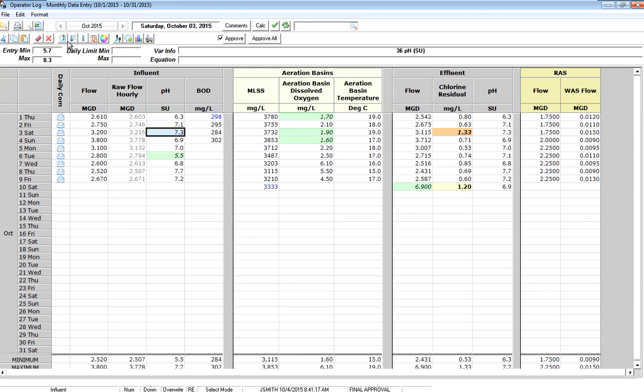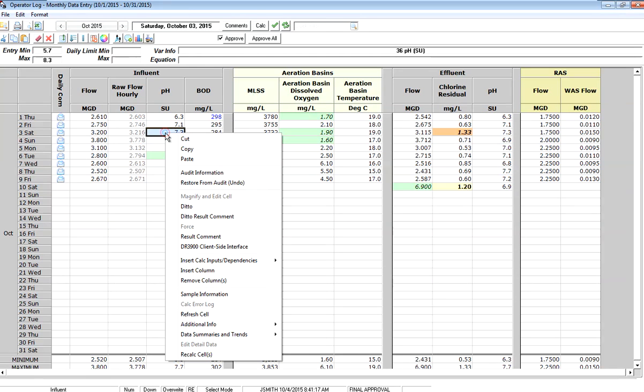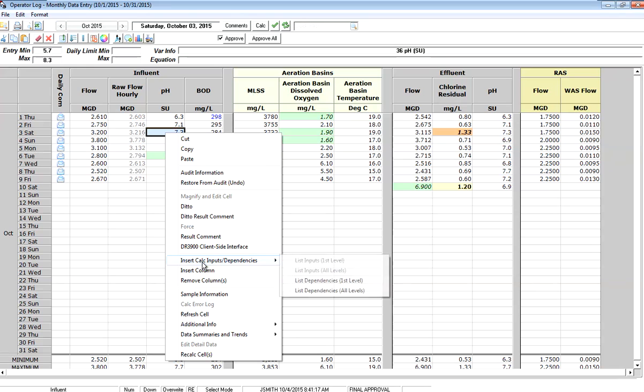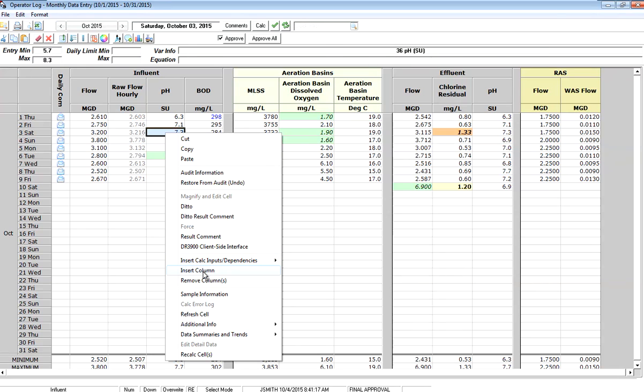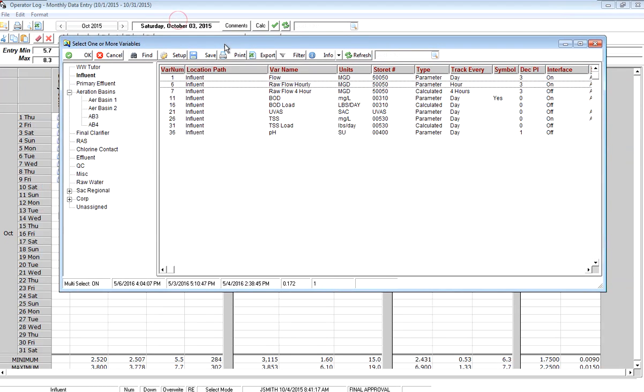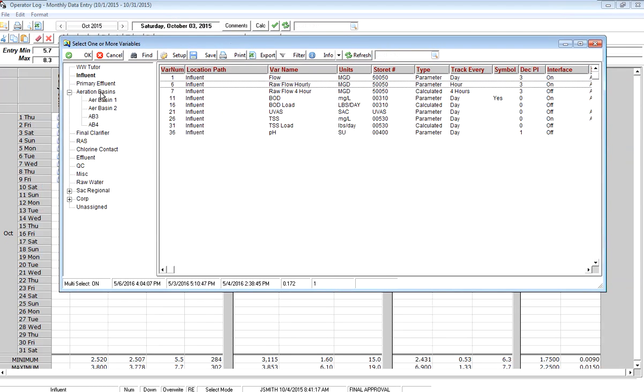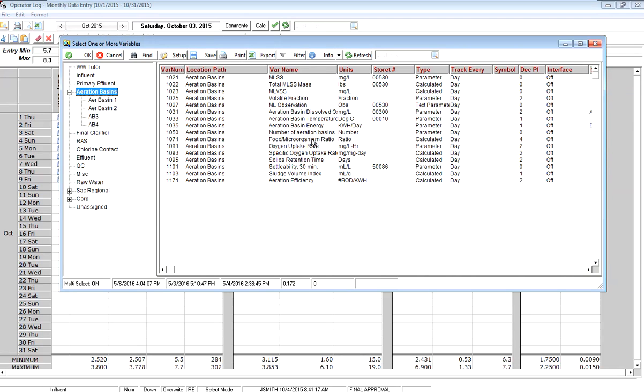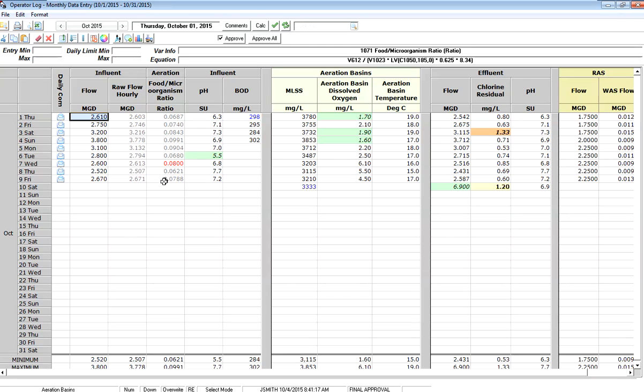So what I can do is I can use this button here to insert a column. You can also insert a column by right-clicking and going to insert column. This will bring up your variable browser. So if I want to look at my F to M ratio, I'm going to click on aeration basins and find my F to M ratio and click OK to bring that variable into this form.